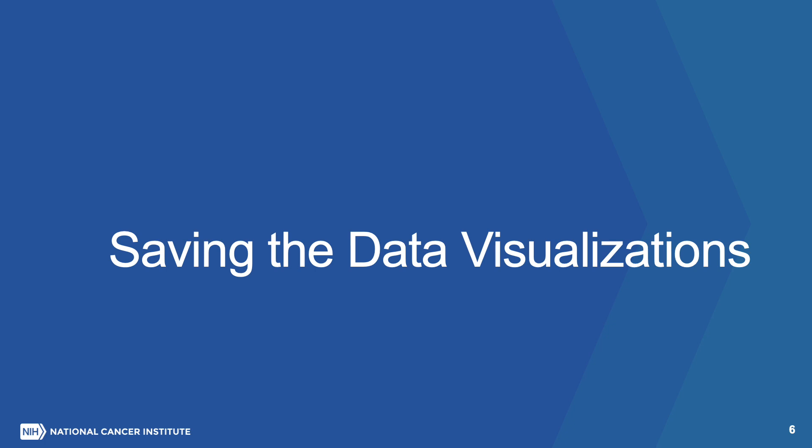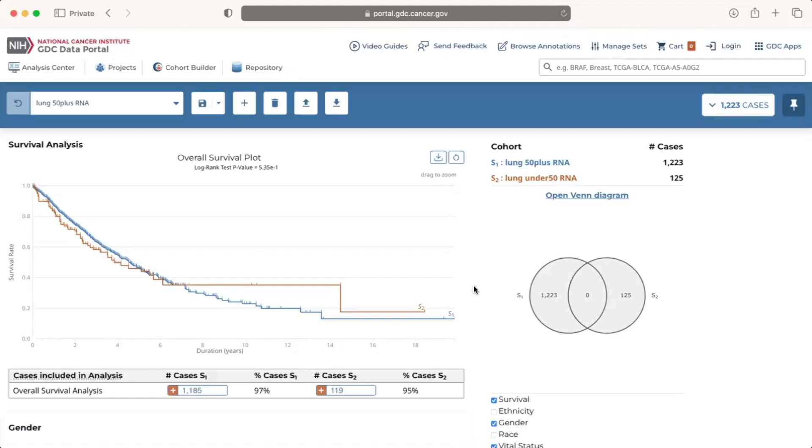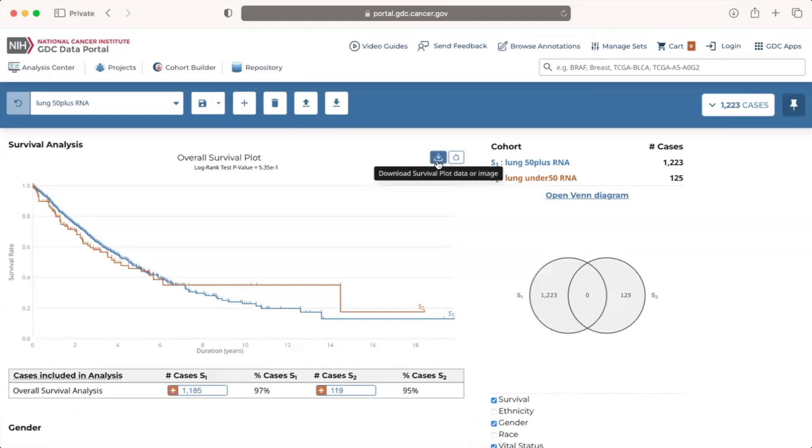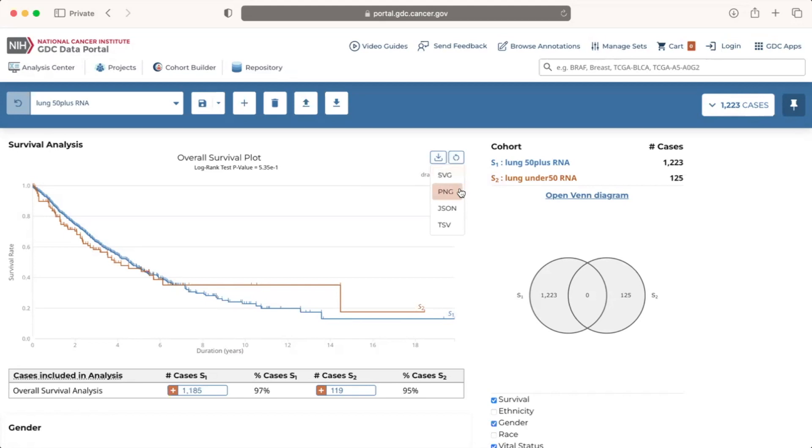Saving the data visualizations. The survival plot and the raw data used to generate it, as well as the data tables, can be downloaded directly from the cohort comparison tool. To download the survival plot and its raw data, we can click on the download icon in the upper right corner of the plot, then select the format, either SVG or PNG for the image, and JSON or TSV for the data.